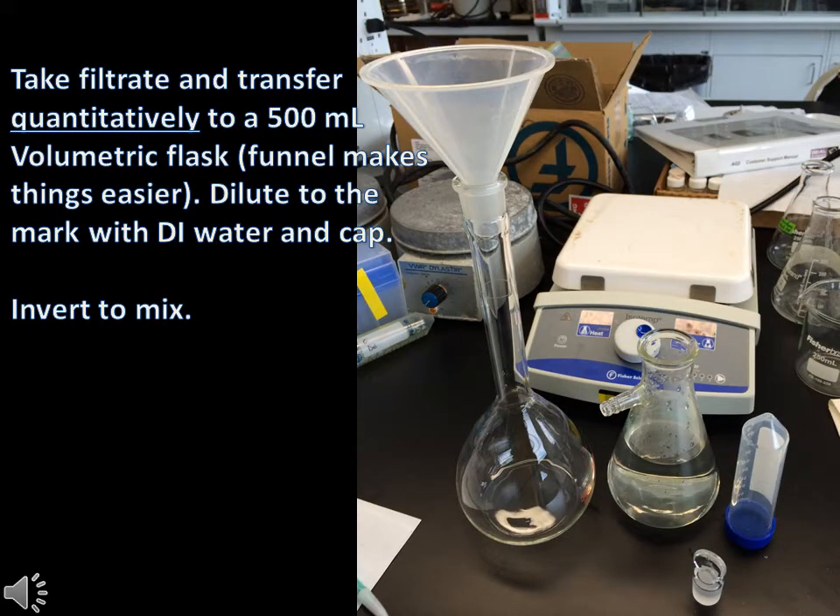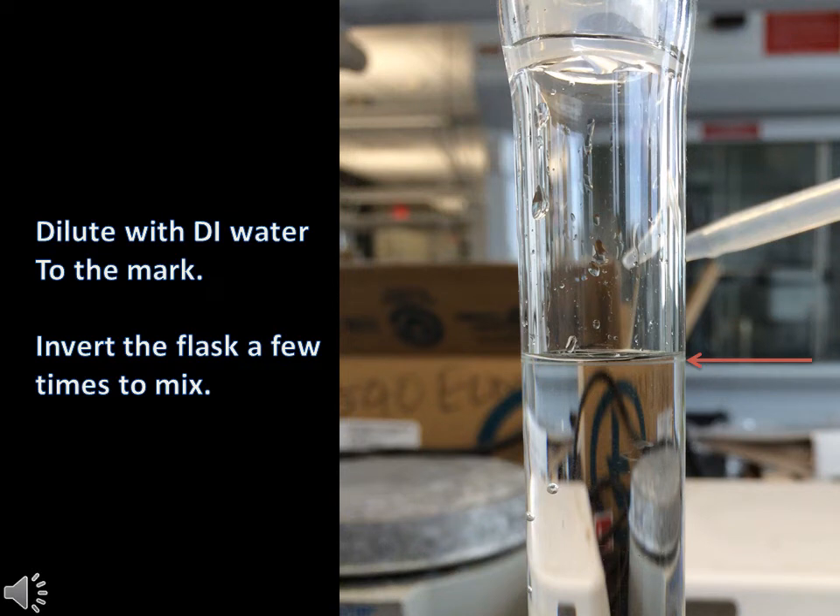Take the filtrate from the filter flask and again quantitatively transfer to a 500ml volumetric flask. A funnel may make things easier in this case. After transferring, cap the volumetric flask. Grab a DI water bottle and dilute to the mark of the volumetric flask. Then cap again and invert a few times to mix.